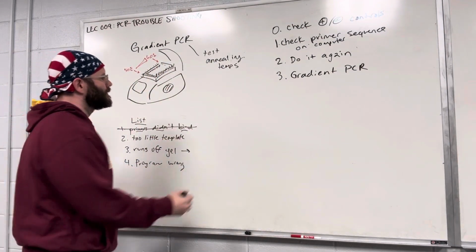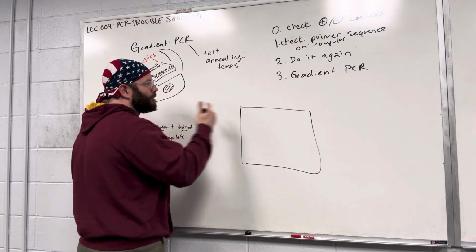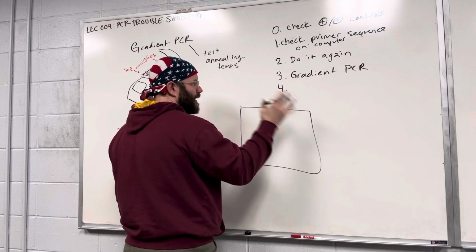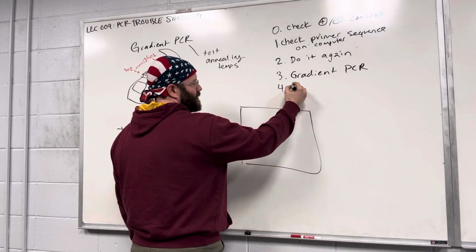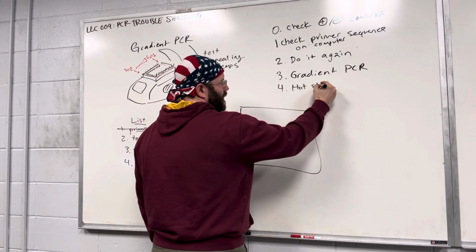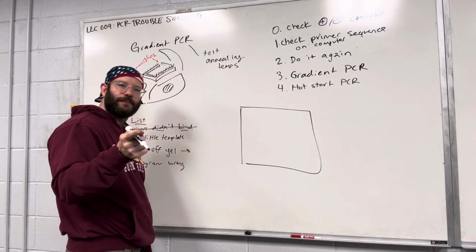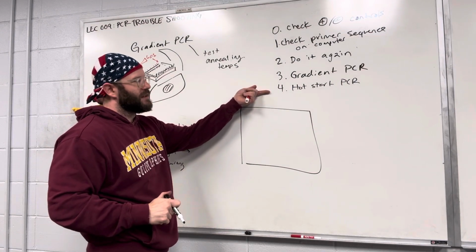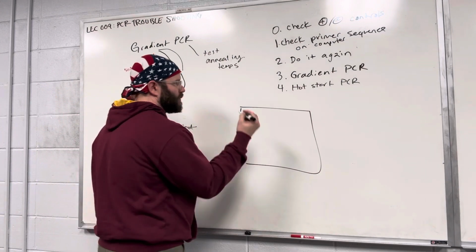Okay, let's do some other things that you commonly see. If your PCR still is not working after gradient PCR, then I try what's called a hot start PCR. Okay, and now I'll talk about primer dimers. So a hot start PCR is a special program that fixes a few common problems with PCRs.